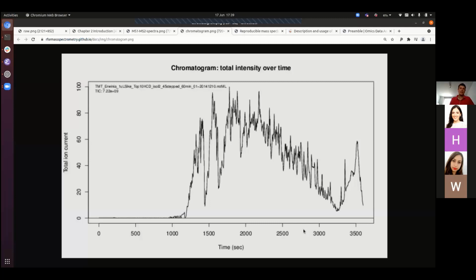That's all I can say in terms of how to choose or how to optimize your experiments in terms of chromatography. And how to know that, but of course that's something that you will know not only by running your chromatography, but running your whole mass spectrometry experiment. And then you will be able to check how many peptides you identify.